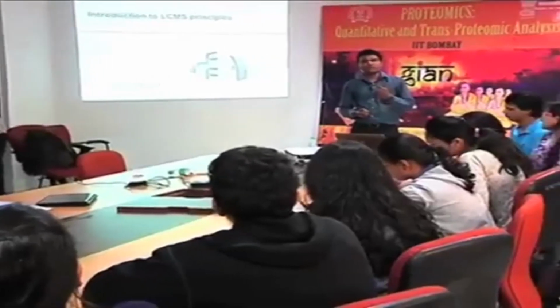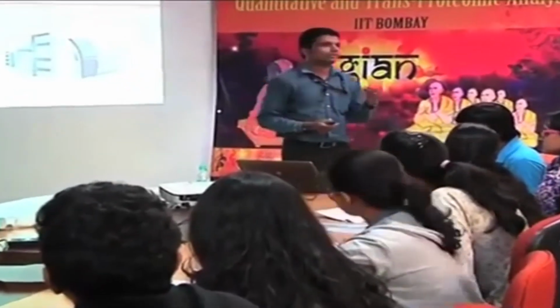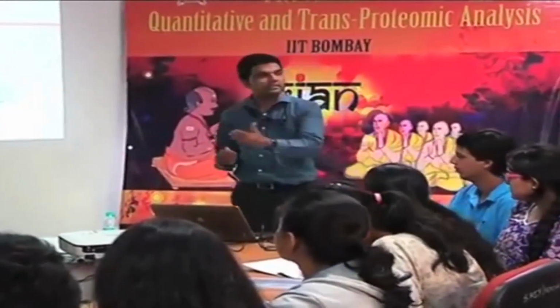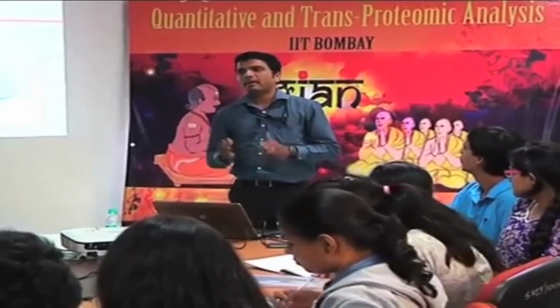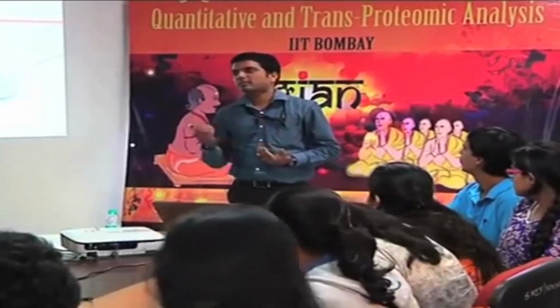Today I am going to discuss the basic principle of the LCMS and LCMS system. First of all, we will try to understand what is the triple quadrupole, what is the LCMS, what is the basic function of the LCMS, how it works exactly, and after this we can see how we can inject the sample, how we can get the data, and how this type of instrument is helpful for the targeted proteomics experiment.